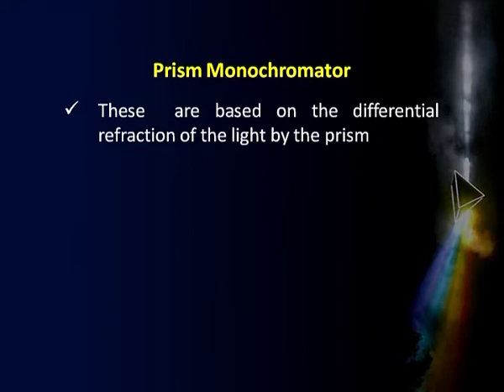radiation. What basically is done is that you have a prism, you pass the light through it, and I am sure that you all have seen that if white light is passed through a prism, it gives you the whole spectrum, the visible spectrum comes over there. That is because this white light is made up of all components, VIBGYOR. Okay. So, the whole visible range is there, and these are of different wavelengths.